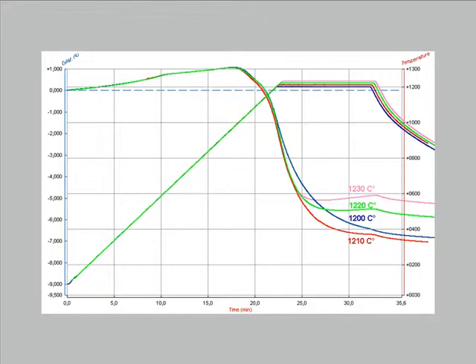The curve of the heat treatment at 1200 degrees C clearly shows that even after 10 minutes at constant temperature, the sintering is not yet completed because the slope of the curve is still quite relevant.